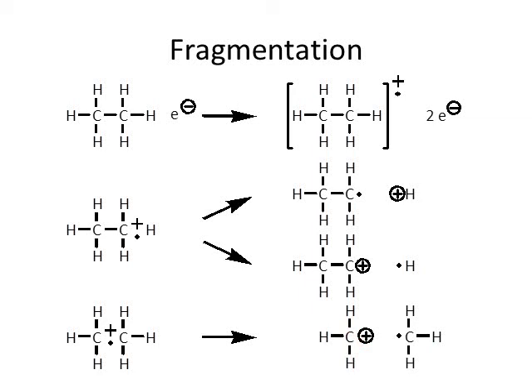Now, in the ionization chamber, you start with ethane and you hit it with a high-energy stream of electrons. And after that happens, all of these things are found in the ionization chamber. This is all in the gas phase, by the way. Various electrons. There's various radical species, and there's various positively charged species and negatively charged electrons. But the important things are the carbocations. Or sorry, I should just say the cations, because they're not all carbocations.